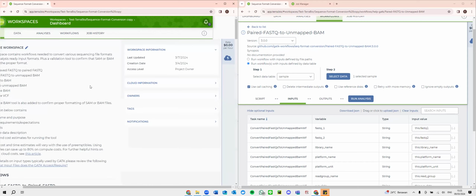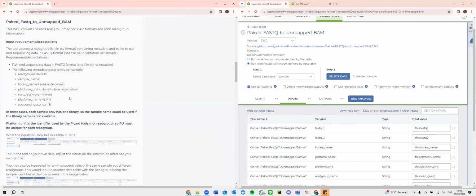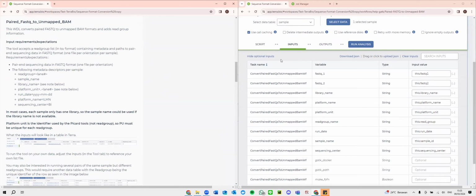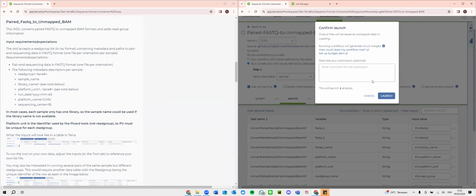Okay, so we'll just go back to the tutorial, and then we'll just continue with the workflow, I guess. There's not much to discuss anymore about the background. So now we've seen the metadata, which is all here. And we'll just go and run the analysis.